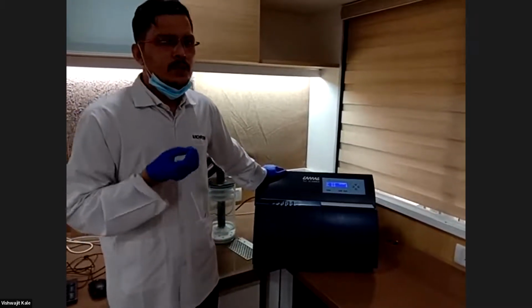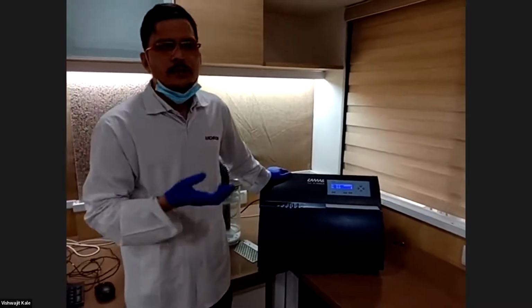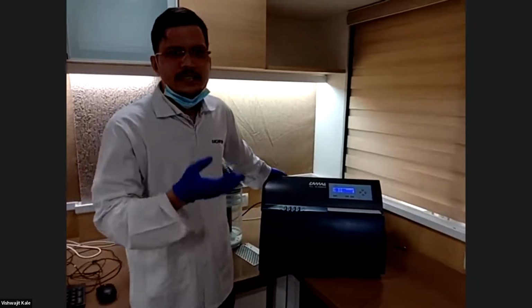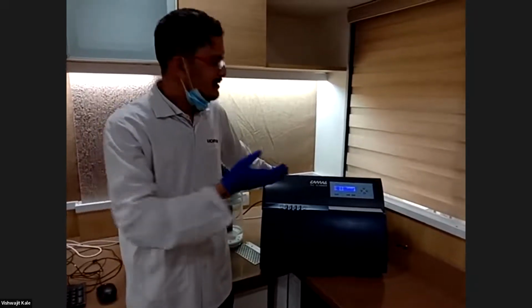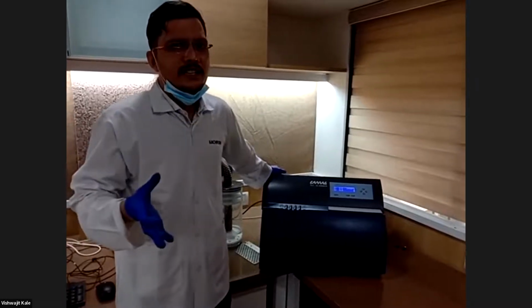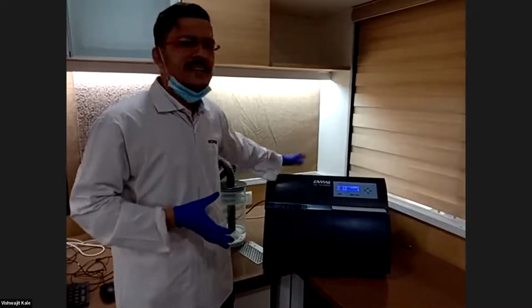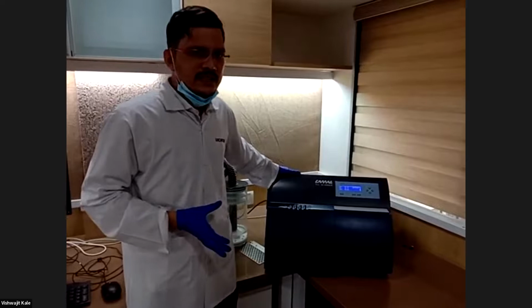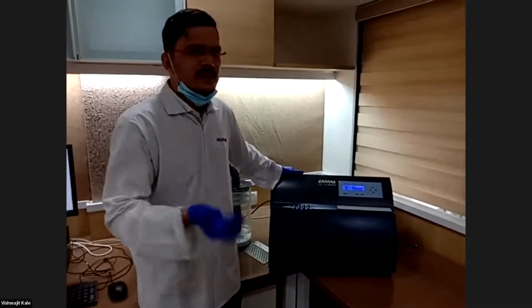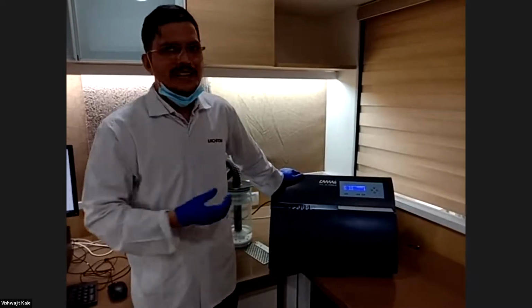Suppose we want to quantify caffeine in green tea, and the lambda max value of caffeine is 276 nanometer. By using the scanner, we can generate 276 nanometer, scan the plate, and find out the exact quantity of caffeine in green tea. So as per the lambda max of any compound of interest, we can select that lambda max by using the TLC scanner, or we can say densitometer, as sir explained in the presentation. We can scan the plate and go for quantitative analysis.